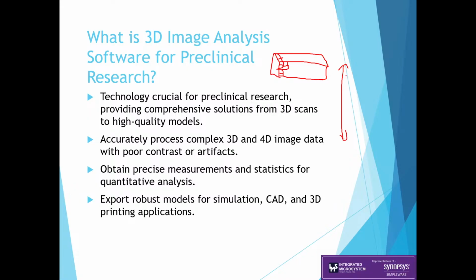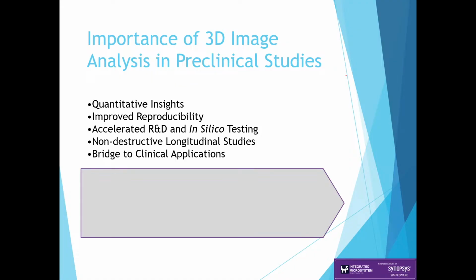Then, when working on any surfaces, we might need to clip them. Clip means, for example, if we have a 280-slice image dataset and we clip at around 140, it will split the dataset into two equivalent parts. Those two segmented and split parts can later be used for 3D printing. So this way multiple options are catered for using 3D image analysis.